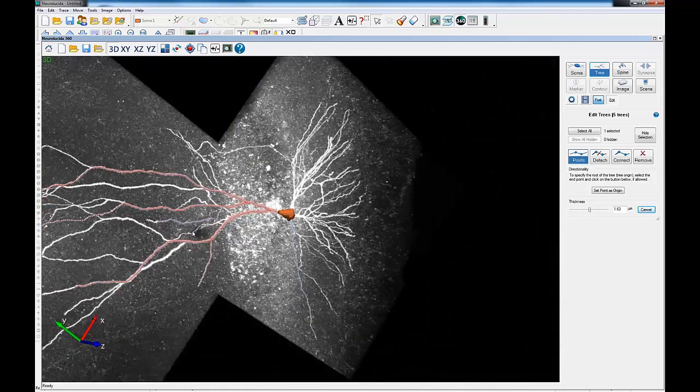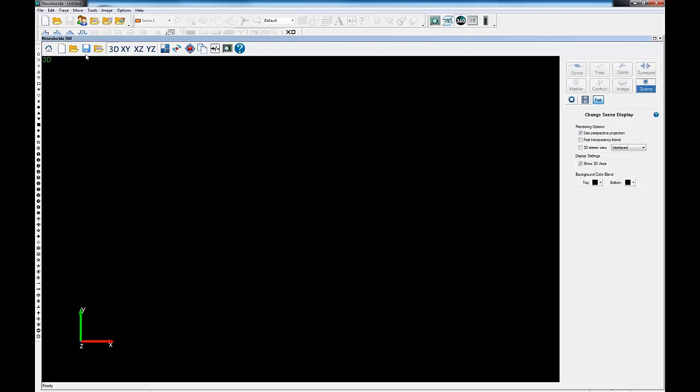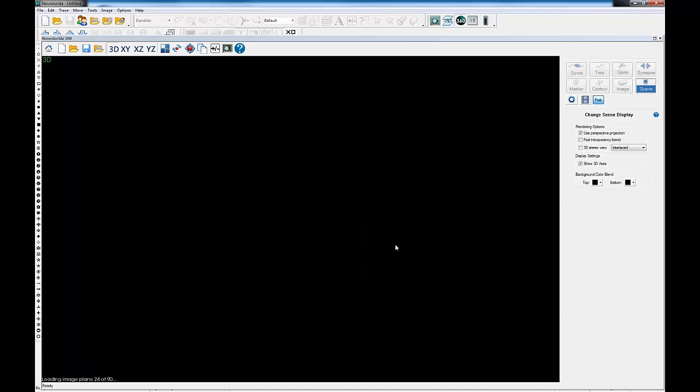Okay, so this is the structures for tracing the somas and for interactively tracing. Let me switch and show you what spines look like. In this case, this image data isn't the resolution necessary to pick up spines, so we'll actually demo that using one of your image stacks. Thank you very much for sharing that with me. So I'm going to load that real quick.